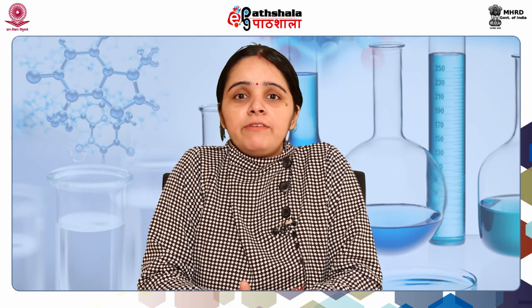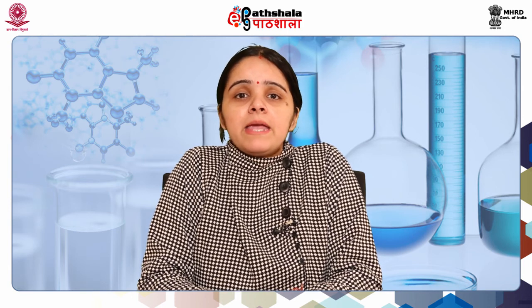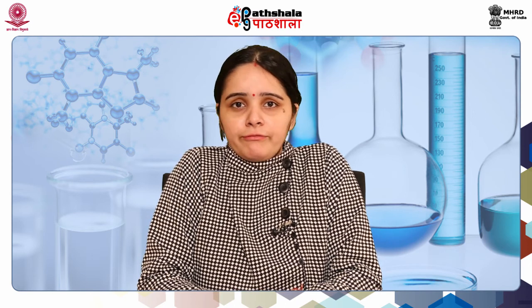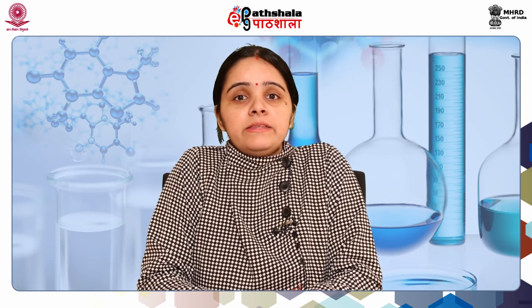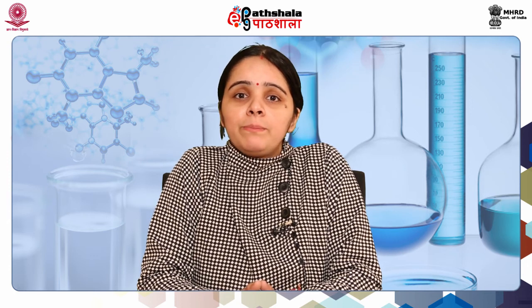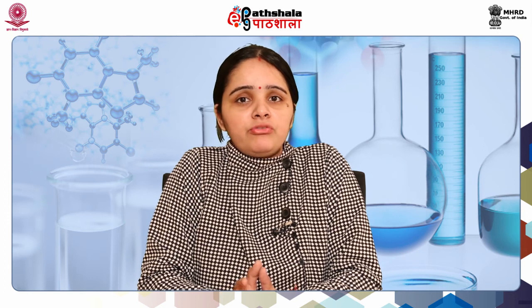Now the third step is the development of the TLC plate. For development of the TLC plate, you have to make a contact between the stationary phase and the mobile phase. So you can take the mobile phase in a jar. It can be as simple as a flat bottom beaker, or it can be a specified jar for thin layer chromatography. If you are using a high polarity mobile phase, then care should be taken that you pre-saturate the chamber. The chamber is pre-saturated by pouring the mobile phase in the chamber. Then you place a filter paper along the wall of the chamber and cover the lid. Now you can keep it aside for 10-15 minutes. It will pre-saturate the chamber.